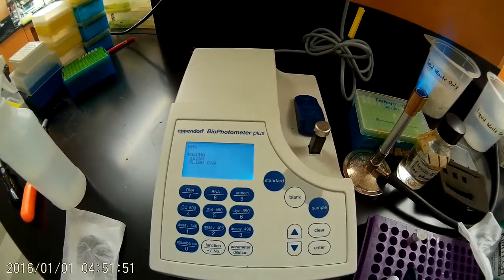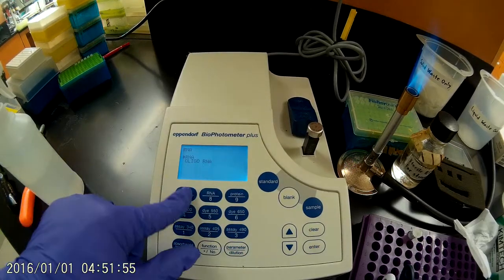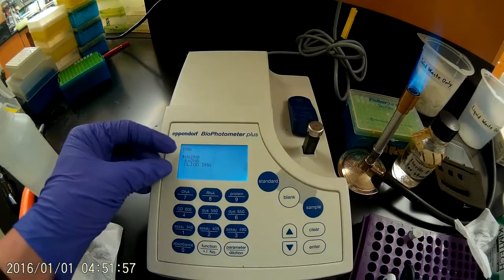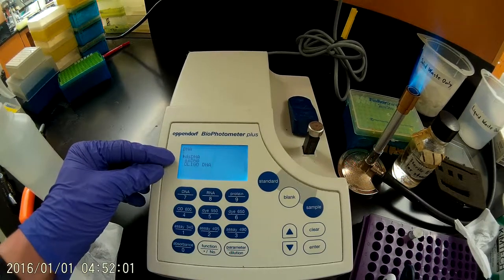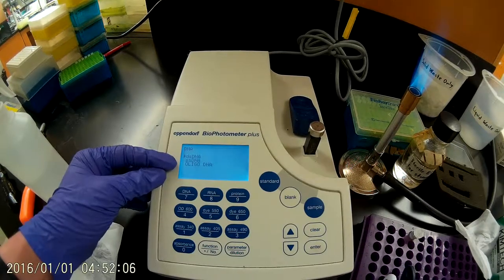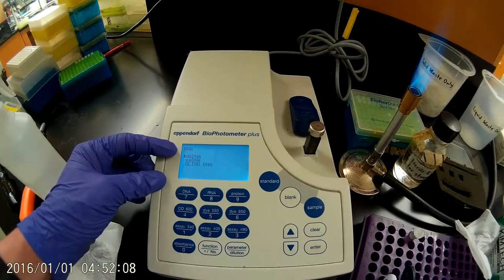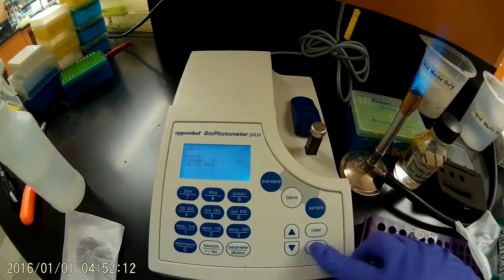And the biophotometer looks like it's already on the DNA setting. If it wasn't, you could just press DNA to get back to that. We have three different settings here: DS-DNA for double-stranded DNA, SS-DNA for single-stranded DNA, and oligo-DNA for small oligonucleotides. So we're measuring a plasmid sample today, so we want to select the double-stranded DNA option. We'll press Enter to do that.